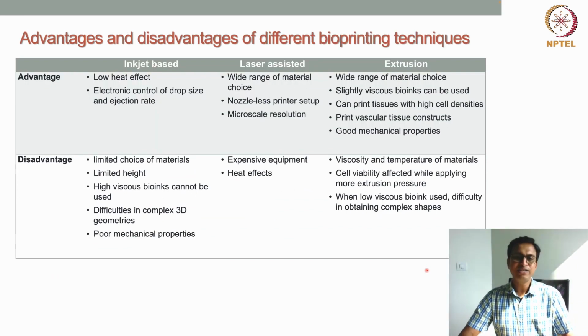Let's see the advantages and disadvantages of different bioprinting techniques. We have discussed some of these things in our respective bioprinting technique, but let us have a comparison of advantages and disadvantages for all three techniques, like inkjet, laser assisted, and extrusion based bioprinting. Let us first talk about the advantages of these three techniques.